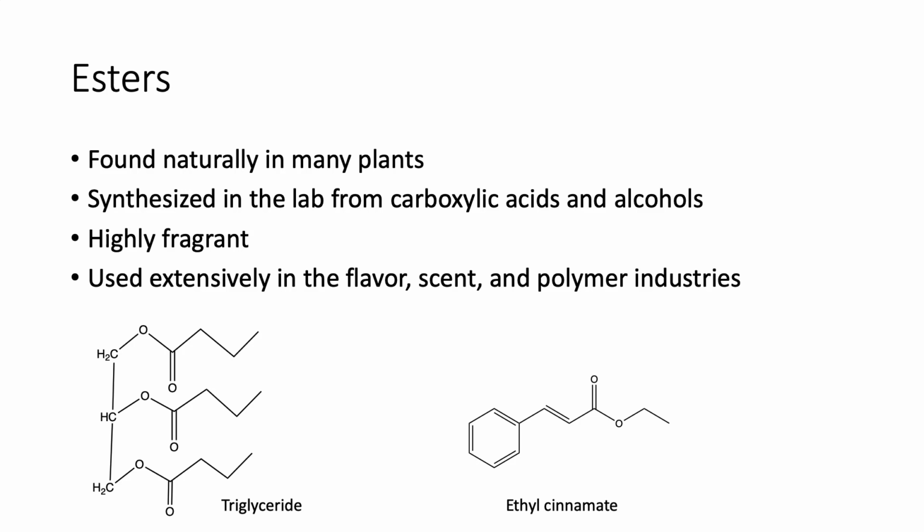And talking a little bit about background information about esters, they are found naturally in many plants. And you can synthesize them in the lab from carboxylic acids and alcohols, which we are going to be doing. They are highly fragrant, as you will experience when you do this lab. And so, as such, they are used extensively in flavorings, scent, and polymer industries.